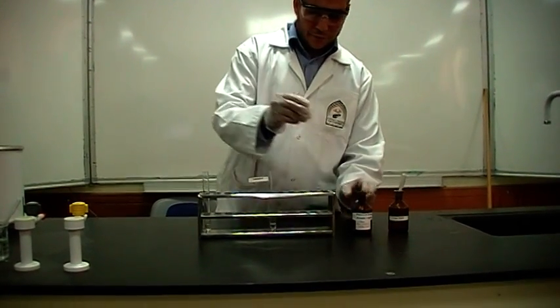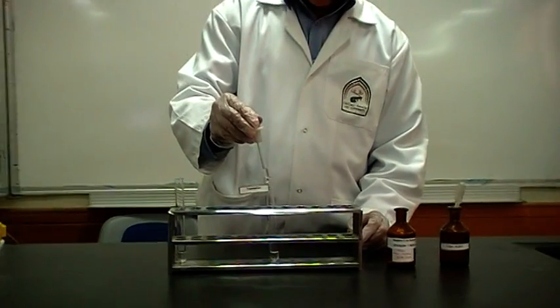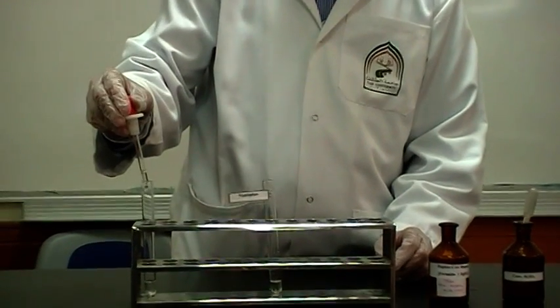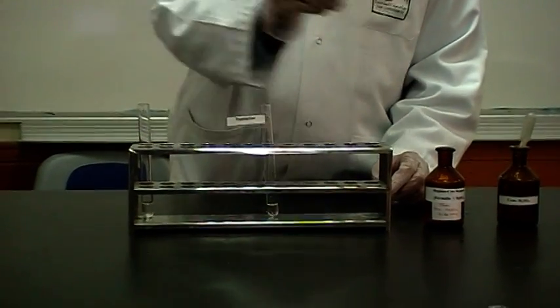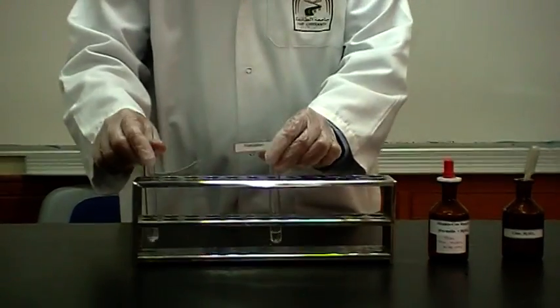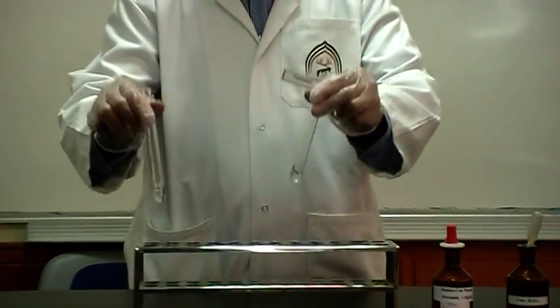So let's start the experiment. Two to three drops of Hopkins-Cole reagent. Shake well.